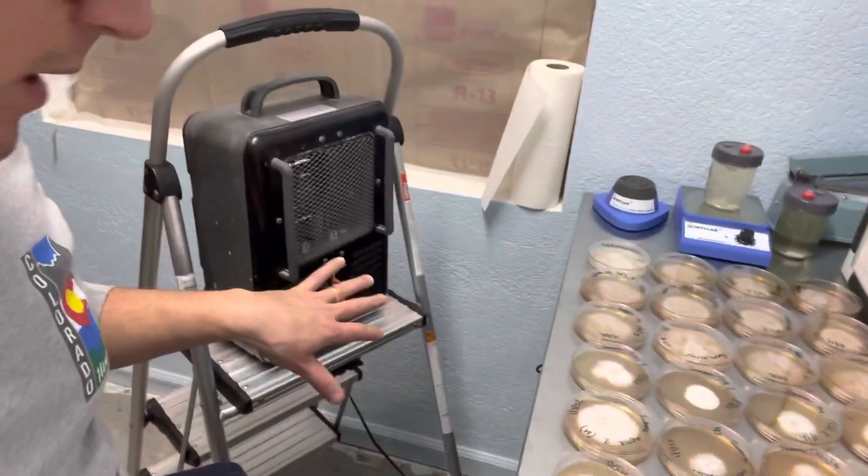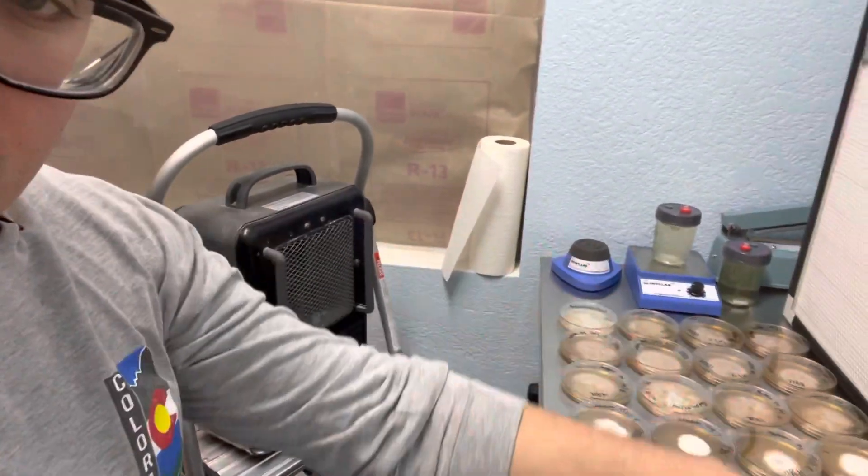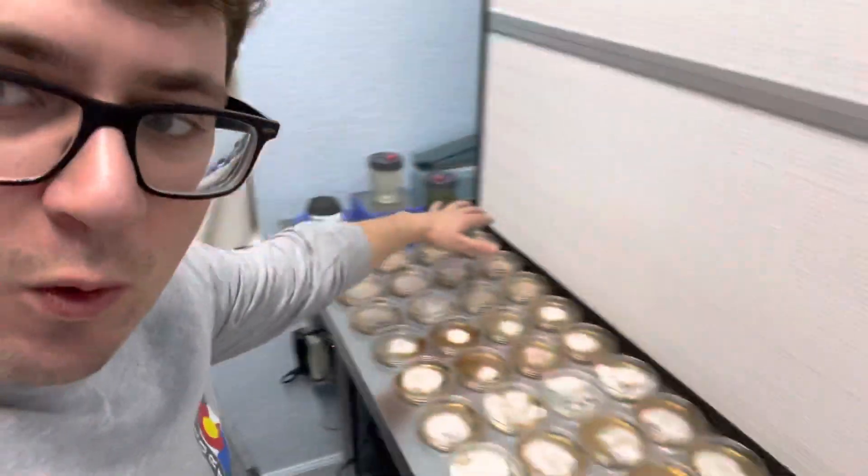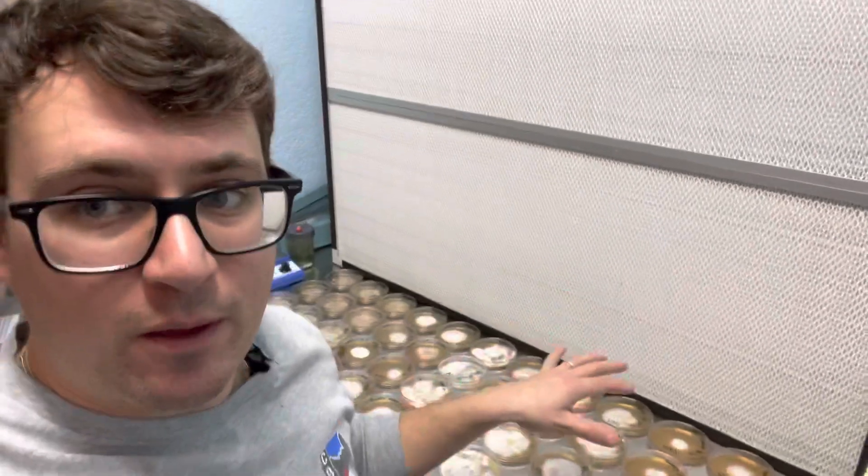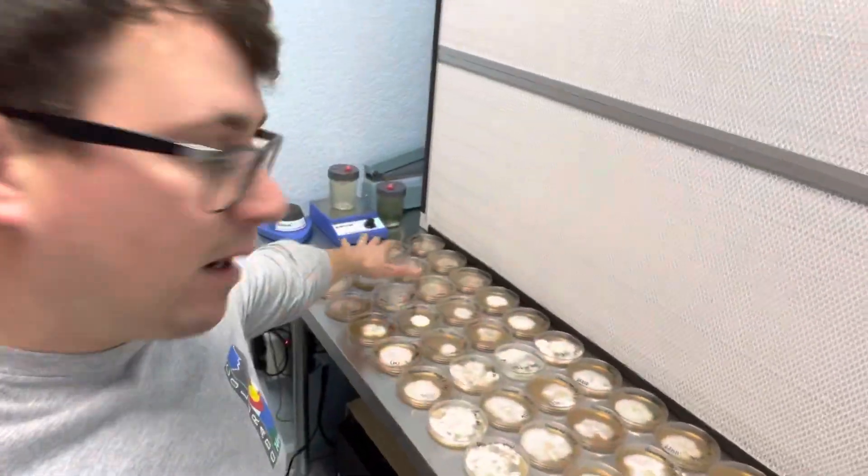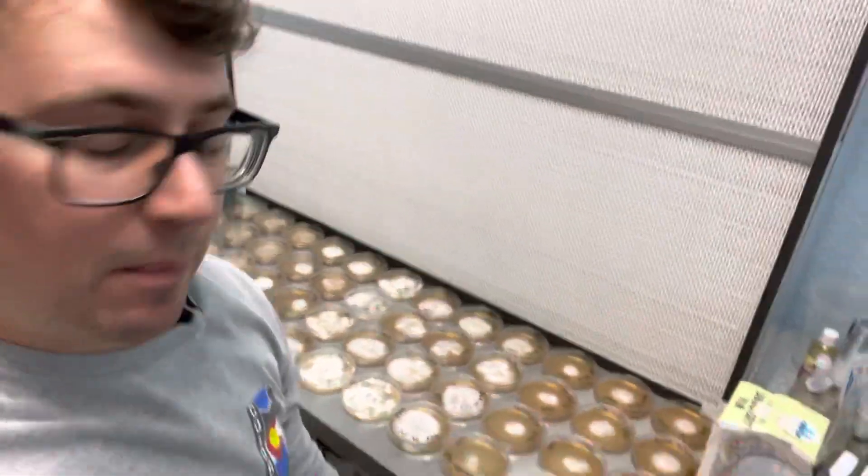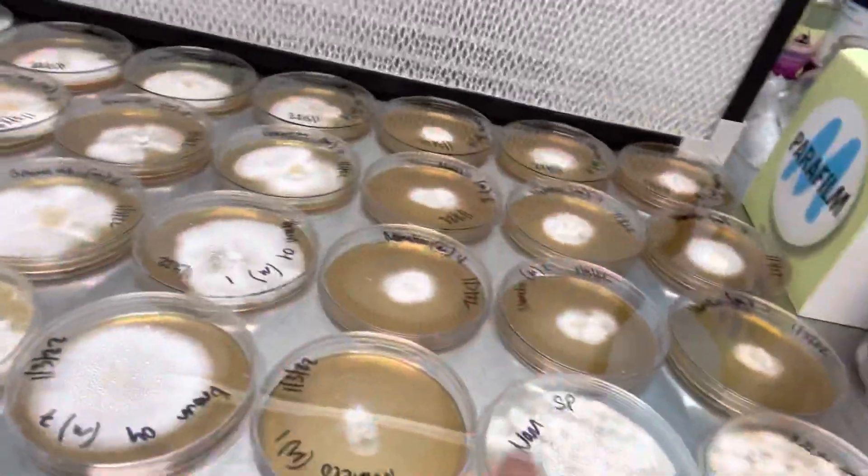...that I do is I put a heater just over the surface of the plates so that it warms the air right above the petri dishes. In about 20 minutes it clears up these water droplets. You can see there's still some left over.